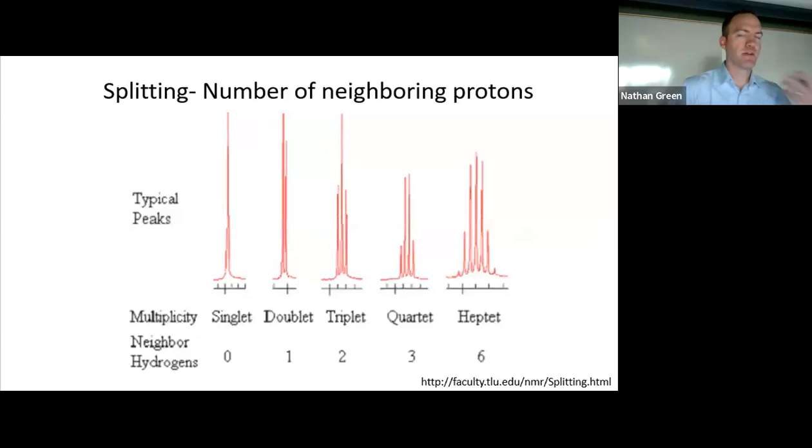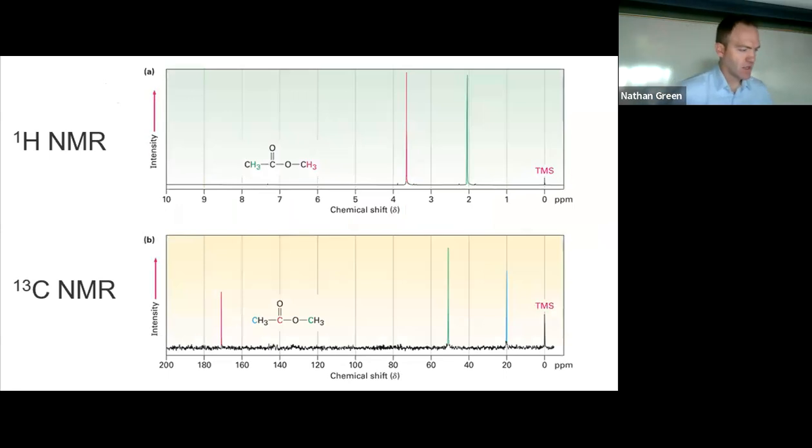Another way of me saying this is, I'm going to endeavor to give you real world NMR data, not always just a sterilized cartoon depiction of data. I mentioned previously that carbon NMR is a thing. This is my only time for bringing it up.